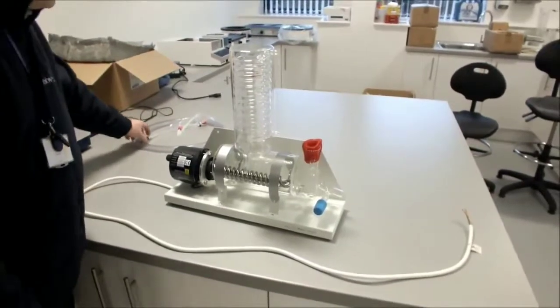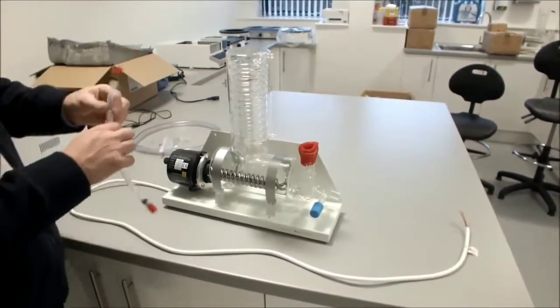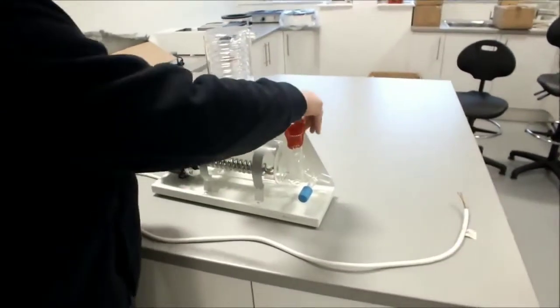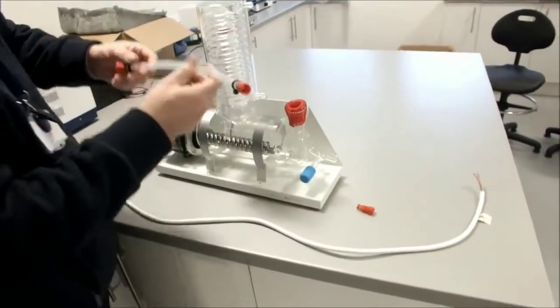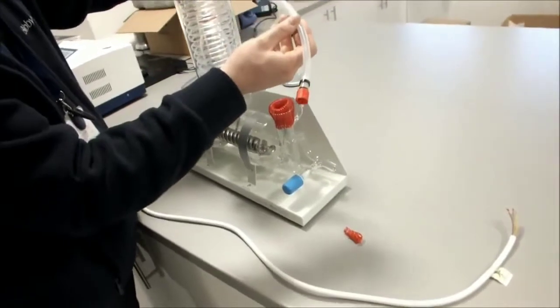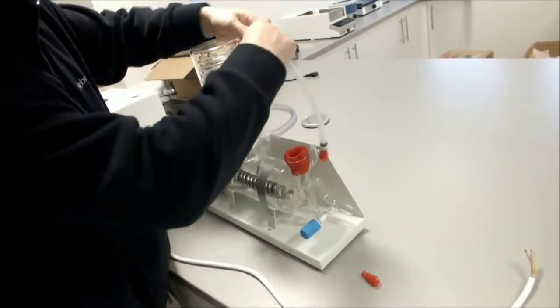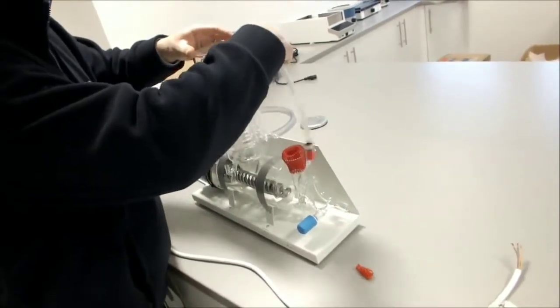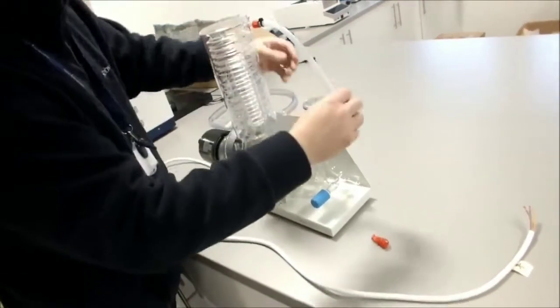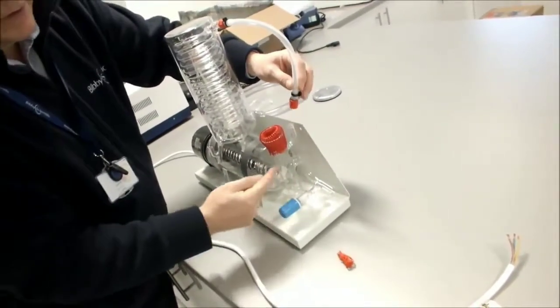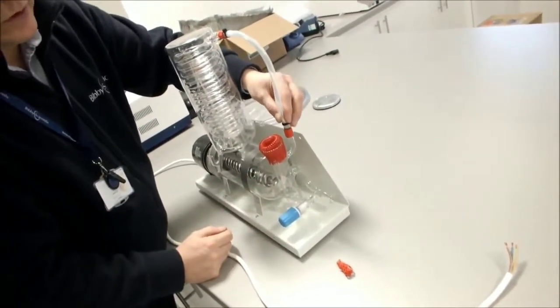When we've done that, we then take our 8mm tubing with the two connectors. We then connect this to the outlet, which is the top of the condenser. We then connect it to the connector side arm of the water constant level control.